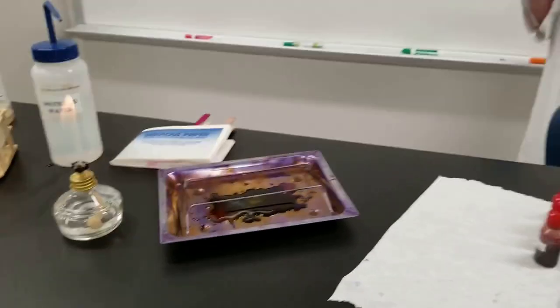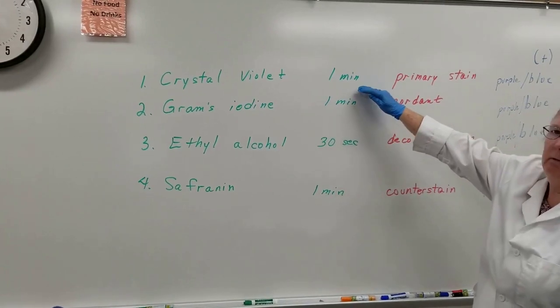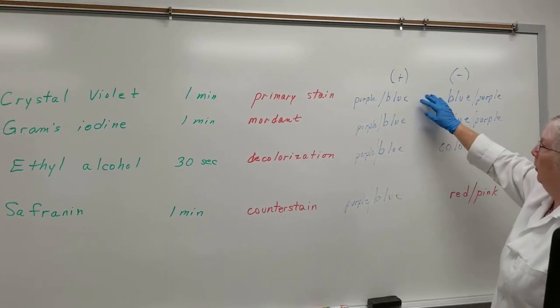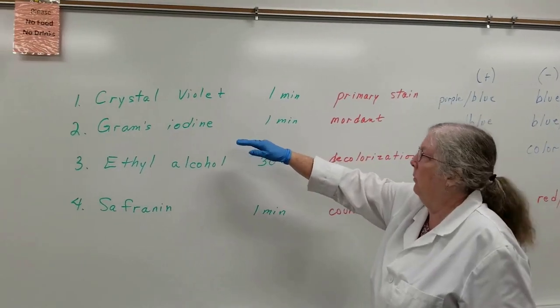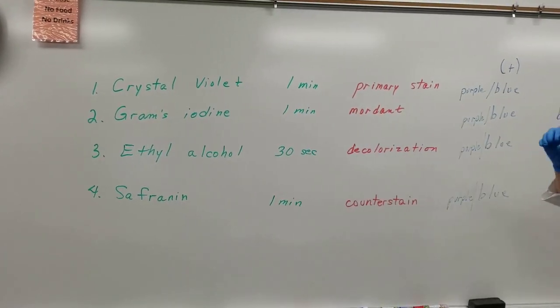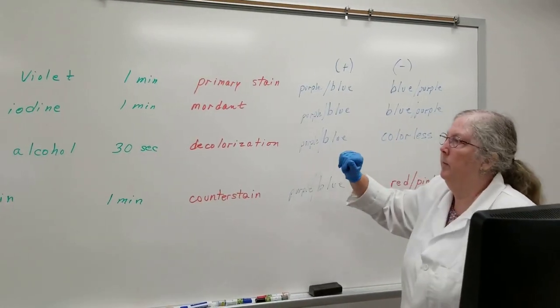Now up here on the board, I did just write a summary sheet of where you can see you add the crystal violet that stays on for 1 minute. That is your primary stain. Both your gram positive and your gram negatives, that's what these stand for, will look that purple or bluish color. Second step, after a minute, rinse that off. Then you're going to add the Gram's iodine. That stays on for a minute. That is the mordant. It's helping to fix that stain. Both organisms would look purple or blue at this point in time.